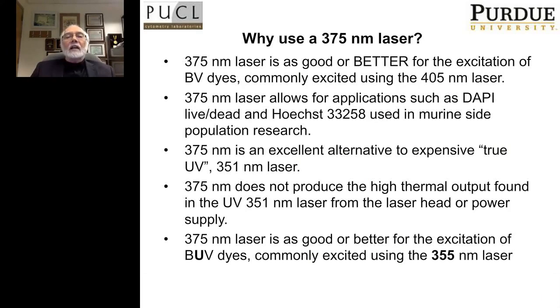So this really is, I think, a very broad spectrum number of dyes you can use. Now, I think it's only recently that the 375 was added to the CytoFLEX. I haven't used the 375 myself, but I know that Bill Telford and some others have used the 375, and I'll show you some of Bill's data in a moment.